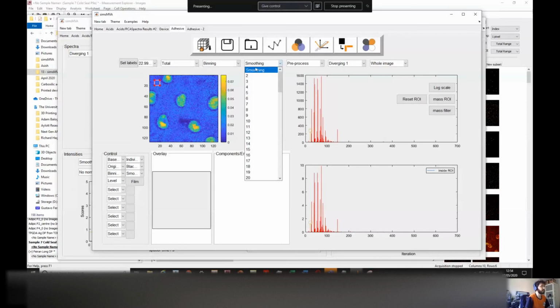The other one is not joining pixels, so it keeps the same number of pixels, but it smooths the data. A small degree is sometimes good to cancel out some noise. But again, if you go too high, you start to blur until you get to the point where you just don't have your real data anymore.